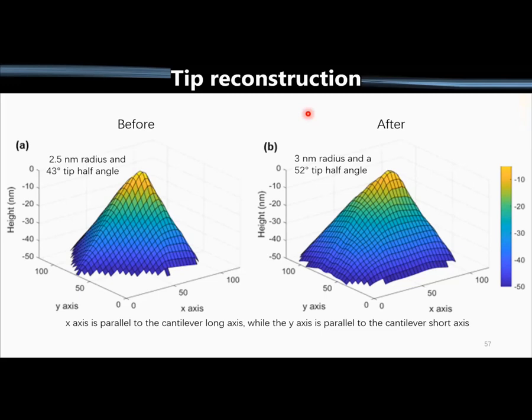So it depends on the fracture, on the mechanics of the material that you're studying. A different material or with a slightly different force or pressure with different mechanical properties might create a sharper trench or line. But we're always going to be limited by the aspect ratio of the probe and how deep the material is if you want to make an isolated nanostructure.